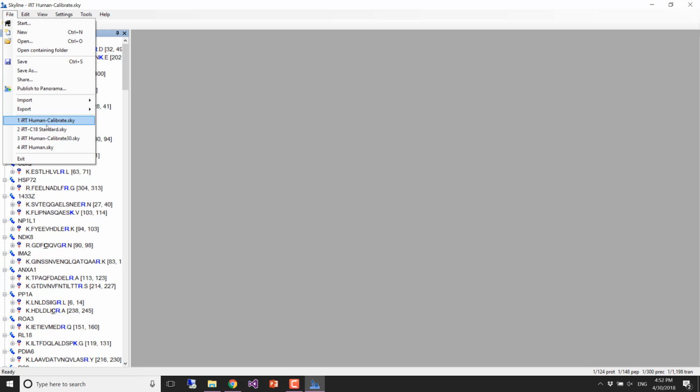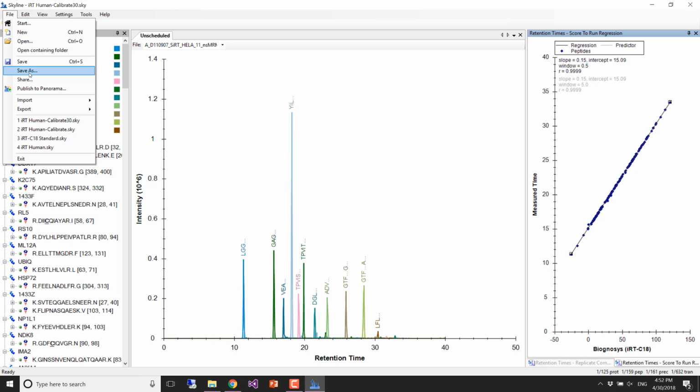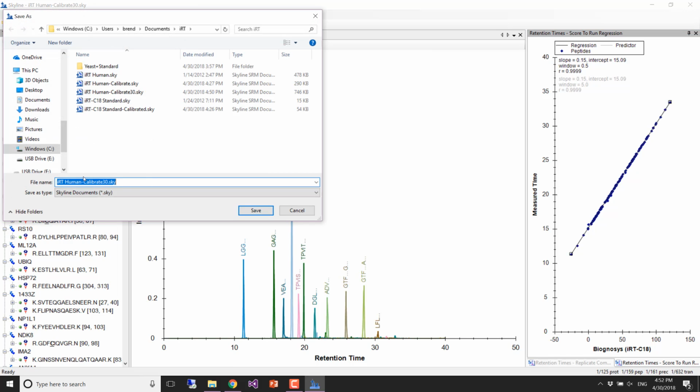So bring up the calibrate 30, and we'll save that as something else. Save as, we'll just call this IRT human 90 and save.